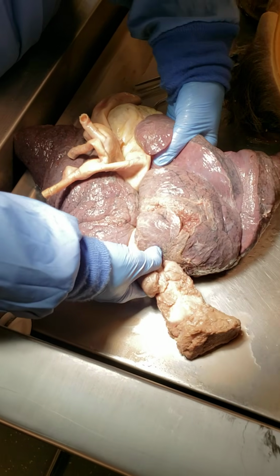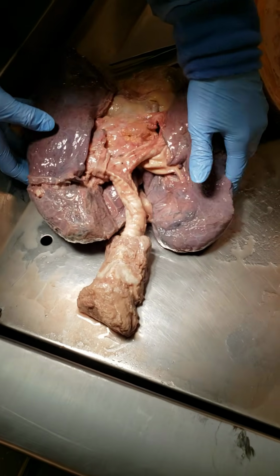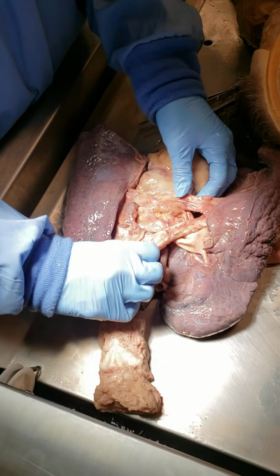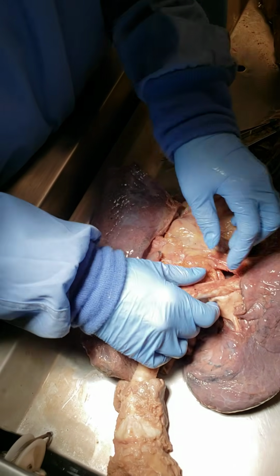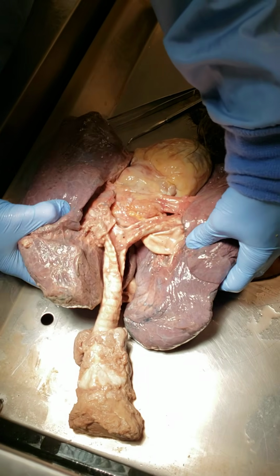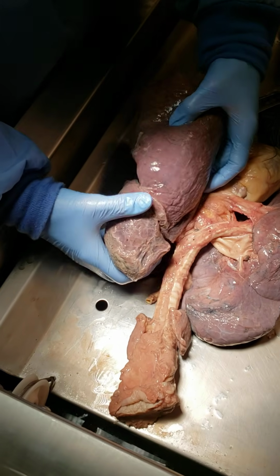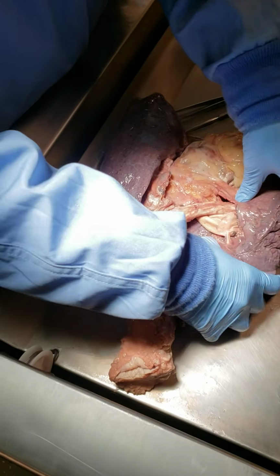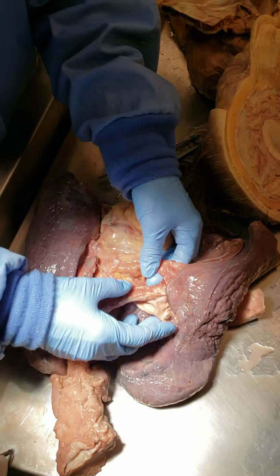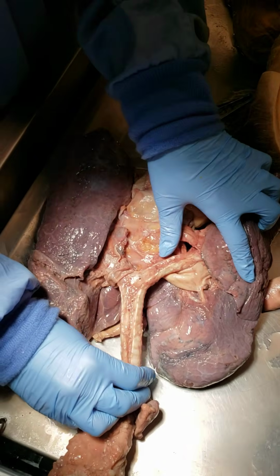Now, I'm going to turn over the lungs because I want to get a posterior view here, and again talk about some of these defining features. So if this is my left lung and my right lung, we're going to be really looking at the airways here.